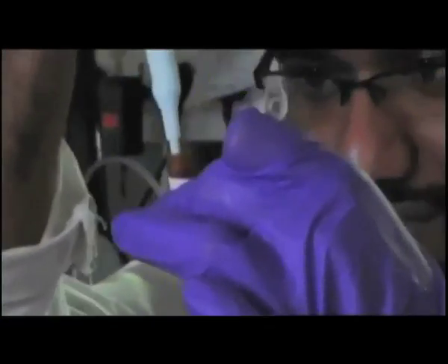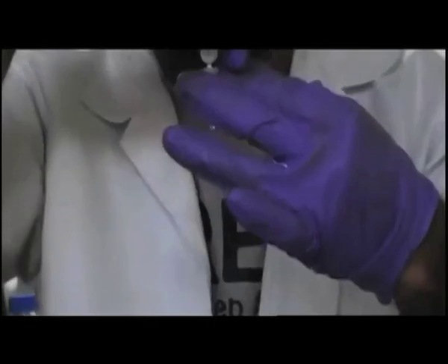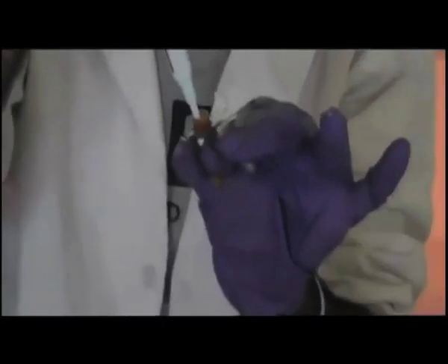Add 1 microliter of Cy dye in each tube. Add 1 microliter of each Cy dye in their respective tubes.